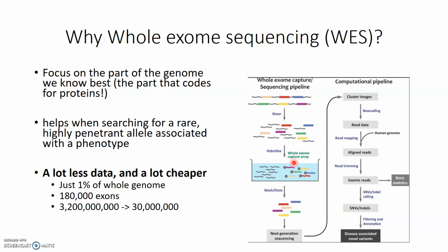One of the deliverables from the Human Genome Project was that only about 1.5% of our genome was actually exon based and immediately translated to protein. So taking out that 99% that we don't need to worry about drastically cuts down our search area from 3.2 billion that you can see there on the screen to about 30 million base pairs.